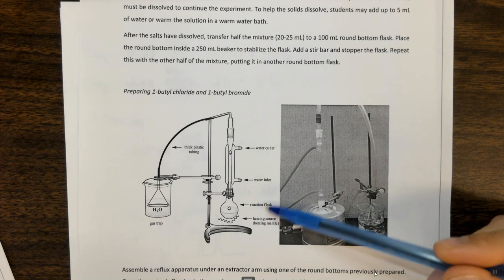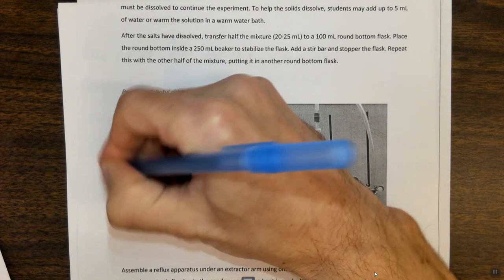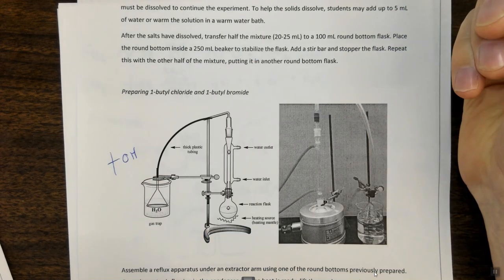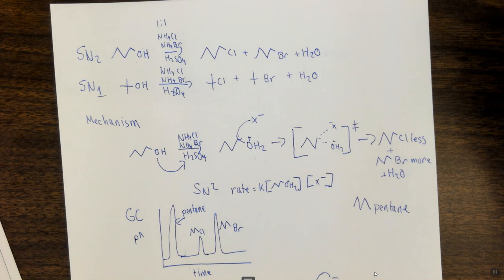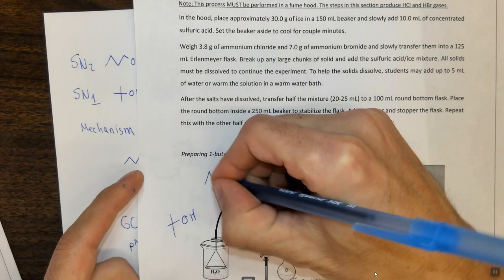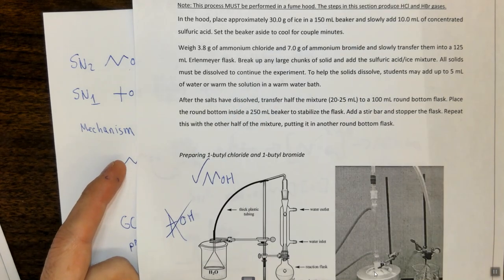apparatus for the 1-butanol. You're not using it for the T-butanol, T-butanol being this one. Sorry, you are using it for the 1-butanol, not for the T-butanol.